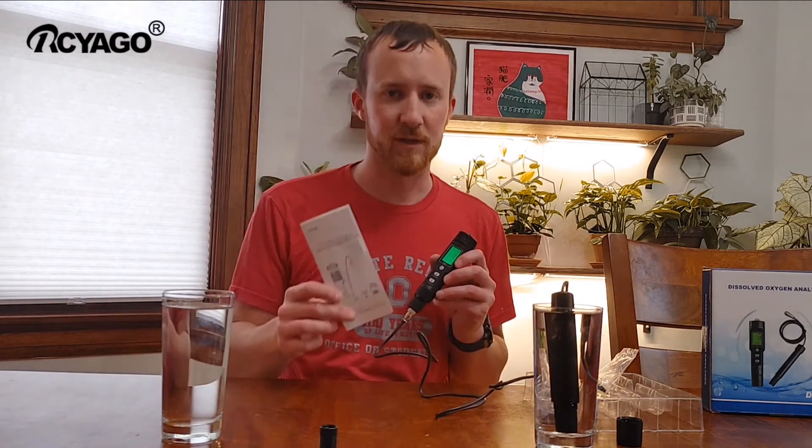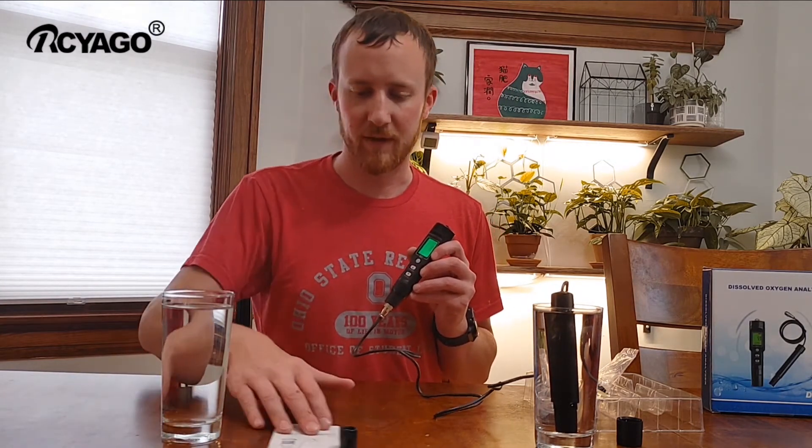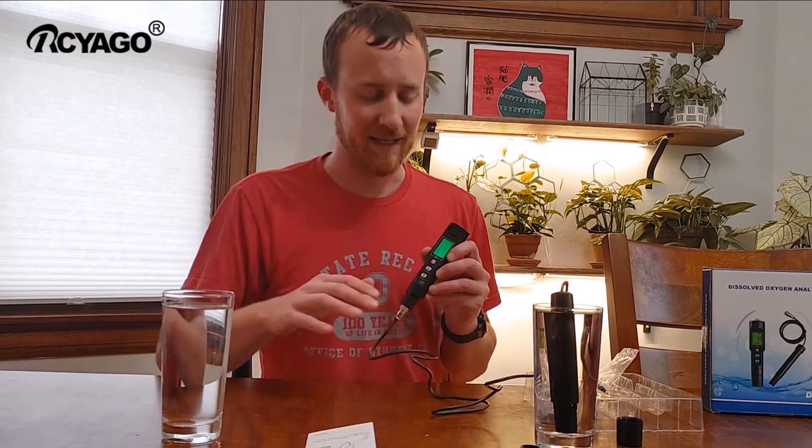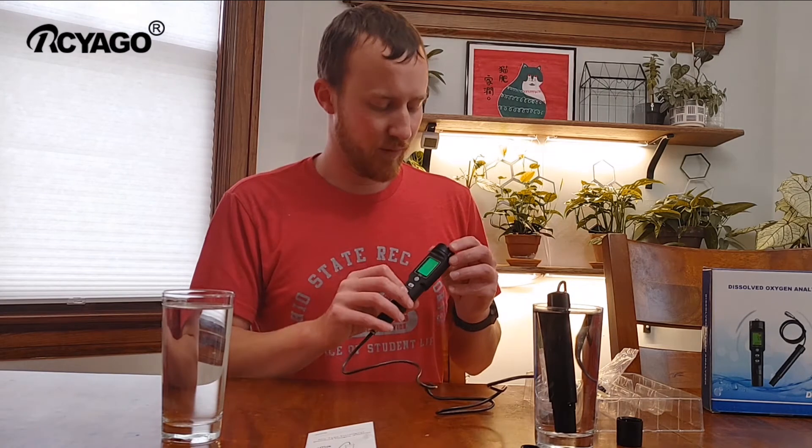The instructions do tell you to calibrate it, so if you know it needs to be calibrated every time, we will get to that.